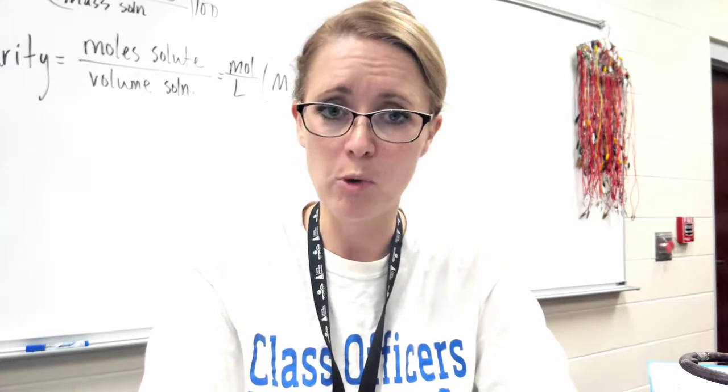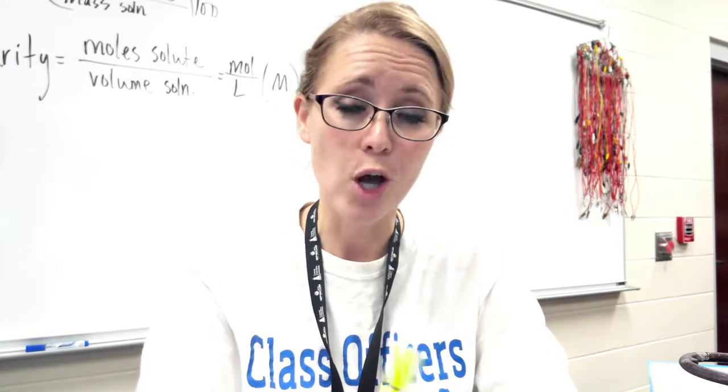Leave lab better than you found it. All equipment should be returned. If the ring stands are hot, they can stay. Everything else needs to be returned. If we glance at your worksheet here for just half a second. I know, I've been talking a long time. You're ready to get going.